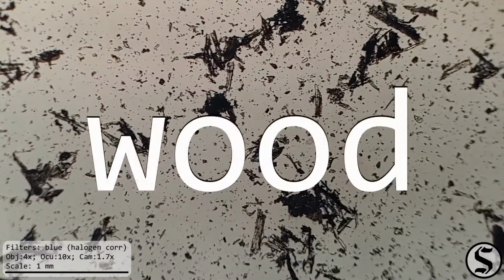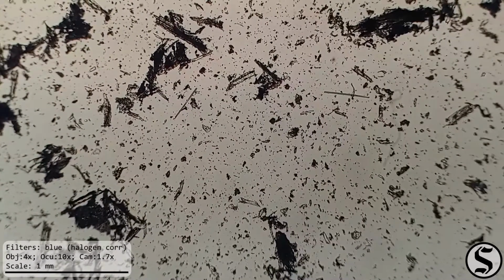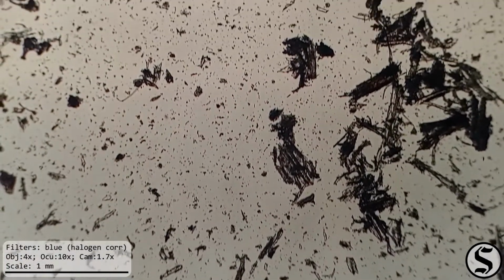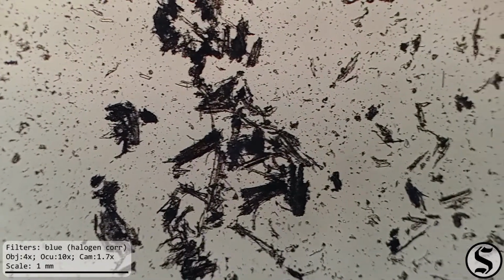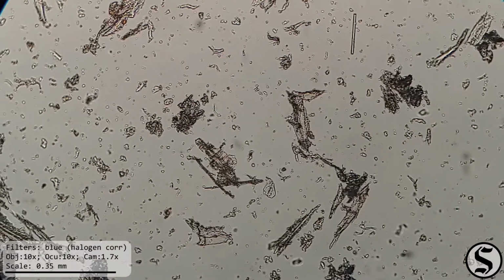So under the microscope now, we're looking at unburned wood. Wood has Germanic roots, and English being a Germanic language, it means what you think it means. But looking at this wood, we can see that the particles definitely have a very splintery nature. They have a definite, recognizable morphology to them. And under higher magnification, we can see that as well.